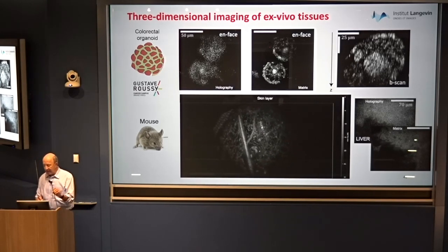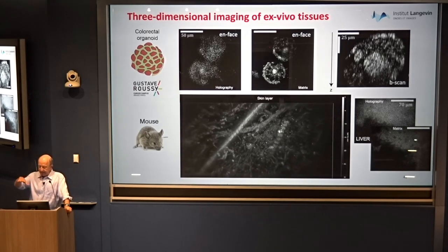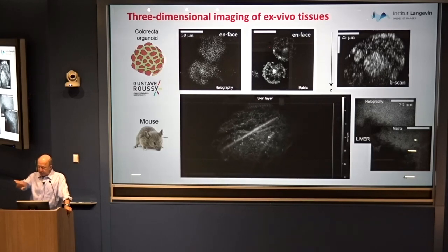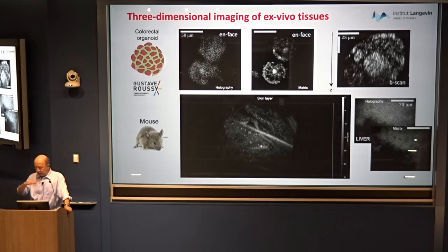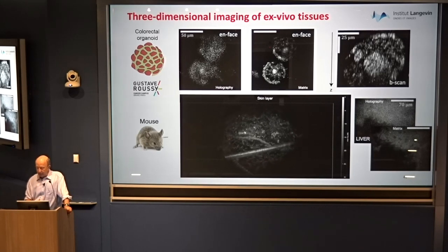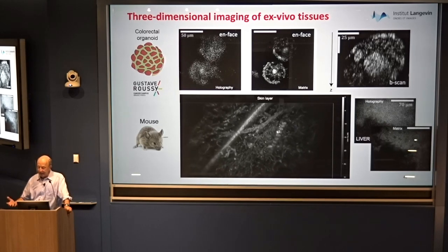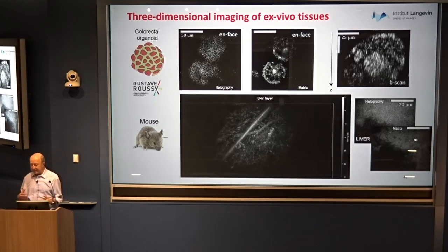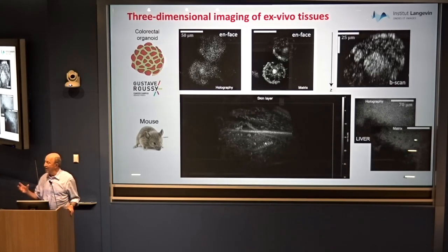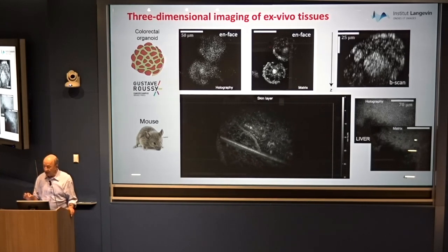It will take some time to have this kind of optical microscope, because the optical microscope that we created here uses exactly the concept of reflection matrix with plane wave illumination, and you record. And once you have this, you can play. But to make a full 3D movie, it takes nearly 1 hour. That is to say, you record the data very quickly, in 0.2 seconds, and afterwards, you need 1 hour to make the movie. But this is just now. This 1 hour of work on the data can, in the future, become quite smaller.